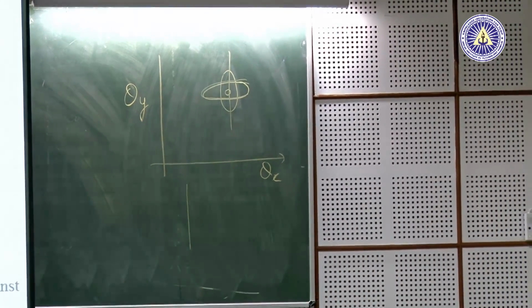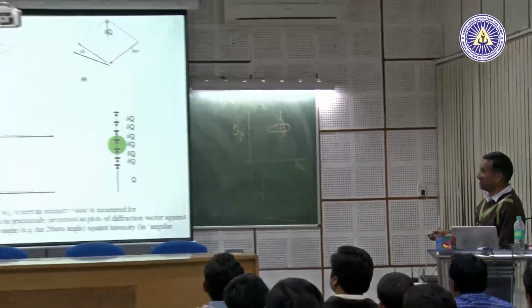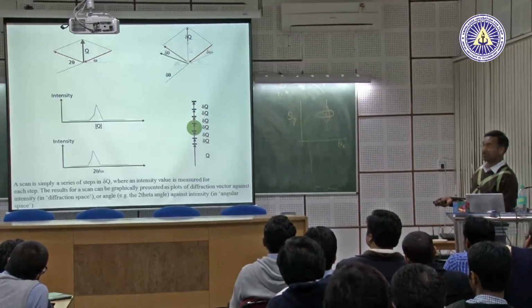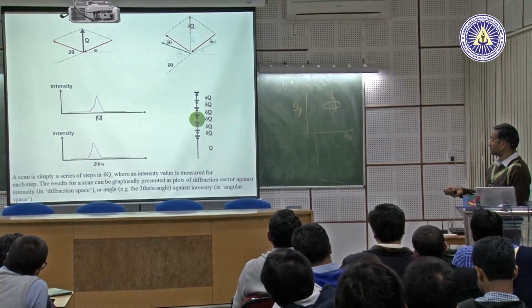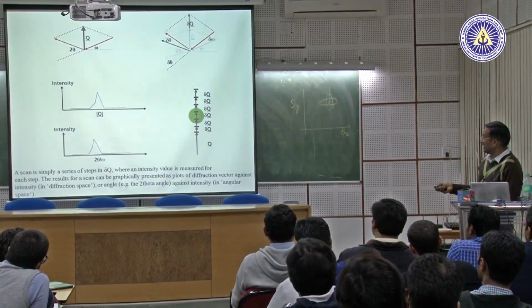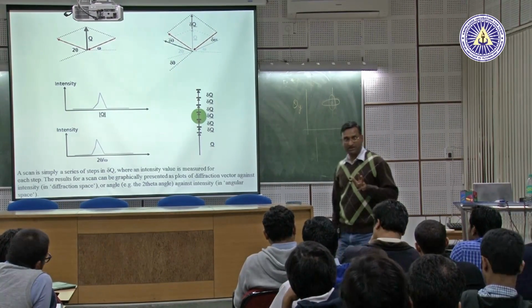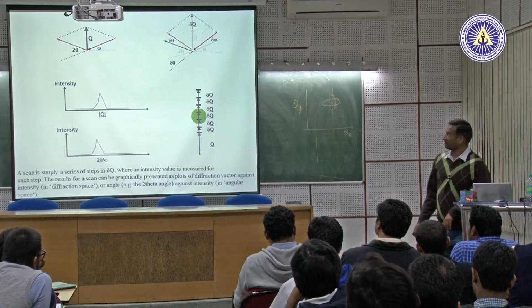So if you have, let's say, variations in the d spacing of the sample or variations in the crystal texture in the sample, you will have some variation in the intensity of this 2 theta along a particular value, and the broadness of this peak will determine the limit of non-ideality in the structure of the thin film.